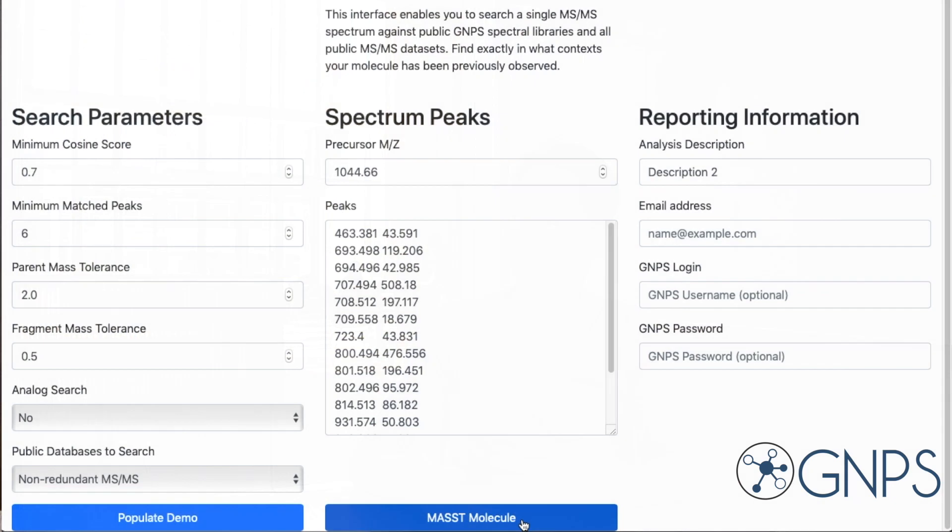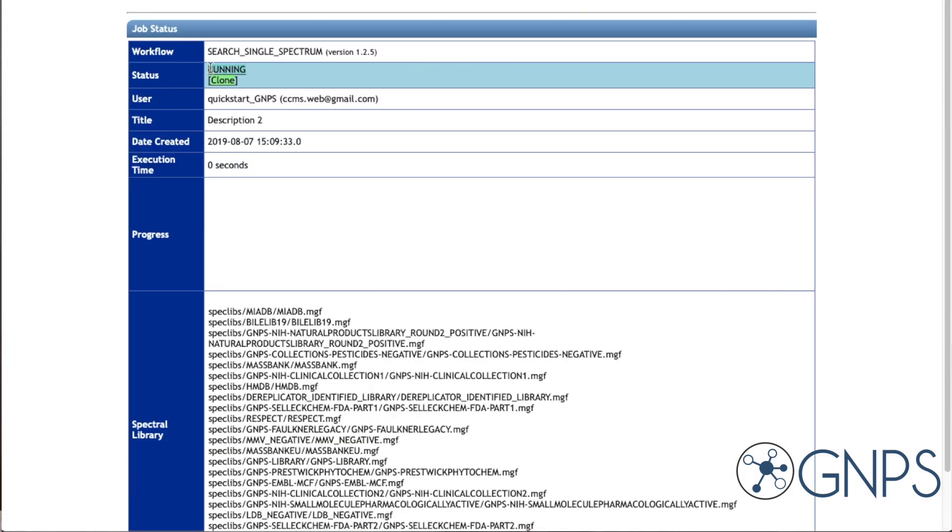For the database to search, we'll use the standard GNPS database. This includes both public datasets at GNPS and imports that had tandem mass spectra from metabolites and Metabolomics Workbench. Once you've chosen that, go ahead and submit — it'll kick off the job. It generally takes about 10–15 minutes for your very first search. Once it's done, you can browse all the datasets and files that your particular spectrum was found in, as well as whether that MS2 spectrum matched any reference library spectrum.